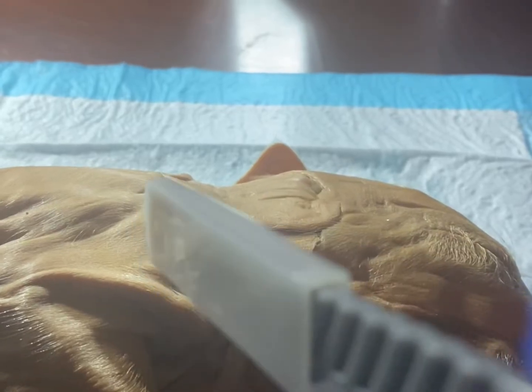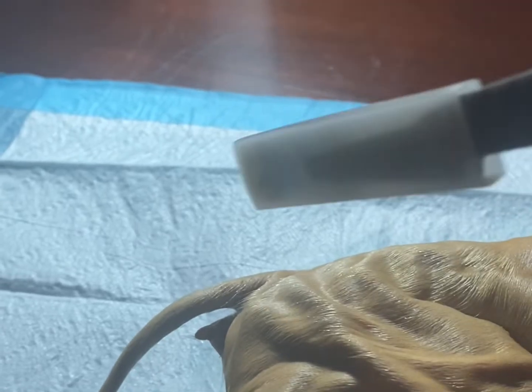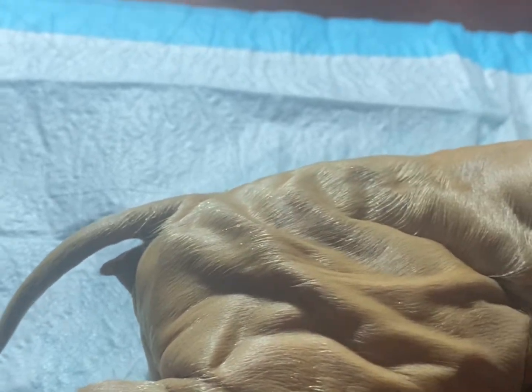The neck region will be from here to about here. And then we have the trunk region, which is all here. And then the tail region is here to her little tail. All right, and then we can see that it is a female pig, as her vulva is on the exterior of her body.